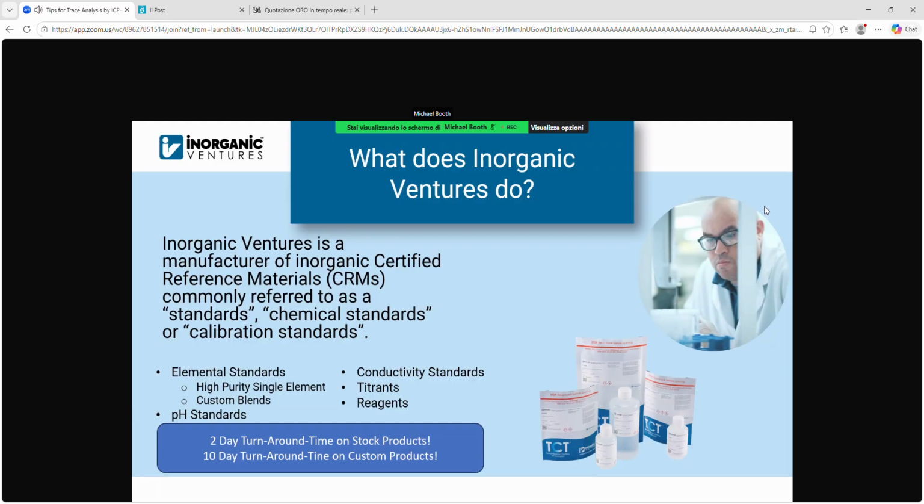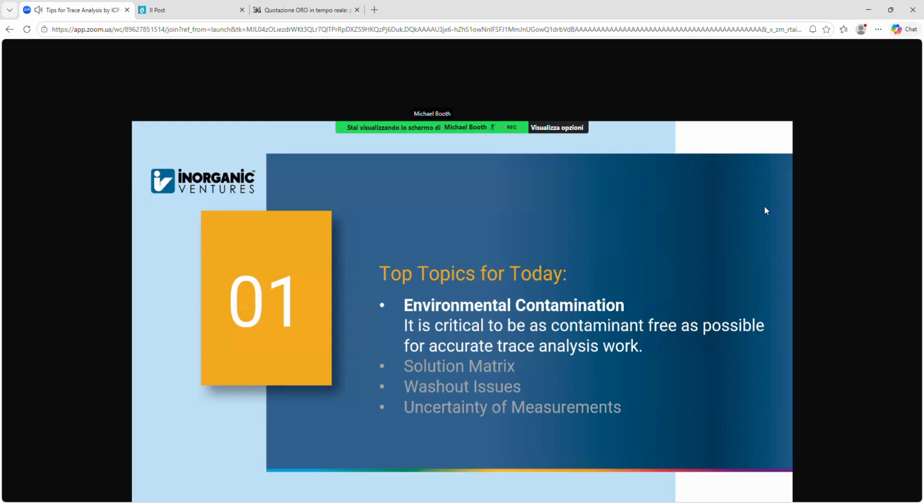But let's dive into today's presentation. Today's presentation is a mix of some of our top topics that we cover when we do these types of webinars or seminar speaking events. We're going to cover environmental contamination, solution matrix, washout issues, and uncertainty of measurement. These are four topics that always get brought up whenever folks want to discuss ICP OES or mass spec. We're going to dig into the details on all of these. But again, if you have any questions, please feel free to ask. Use that Q&A box, and we'll get those answered for you this morning.